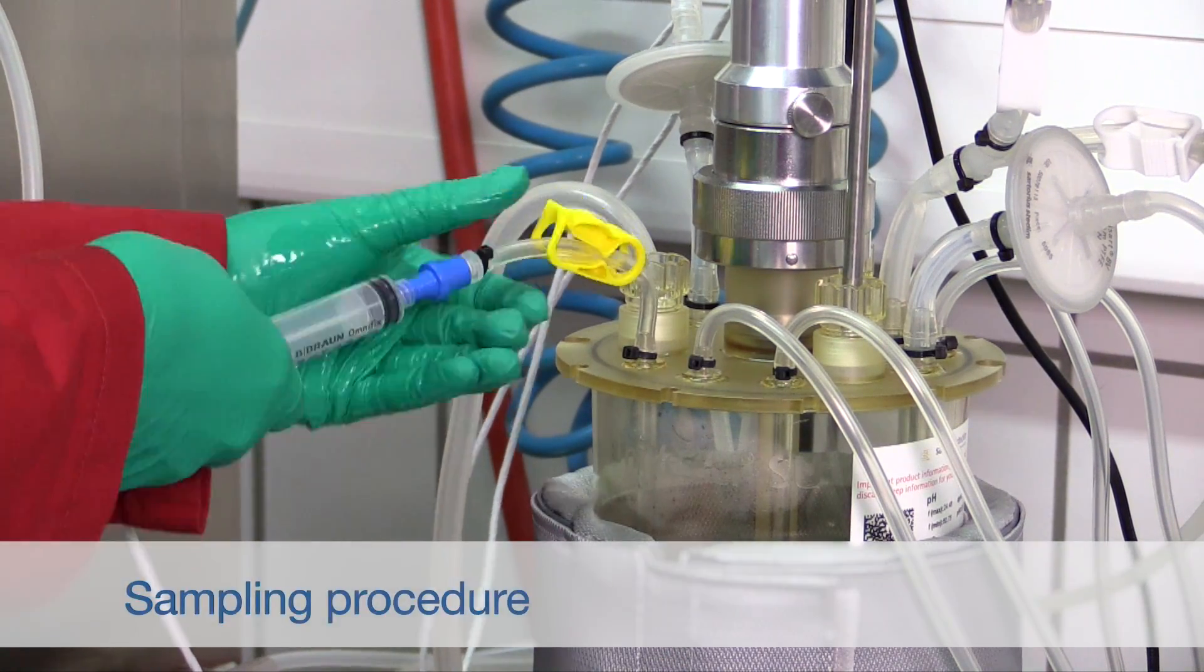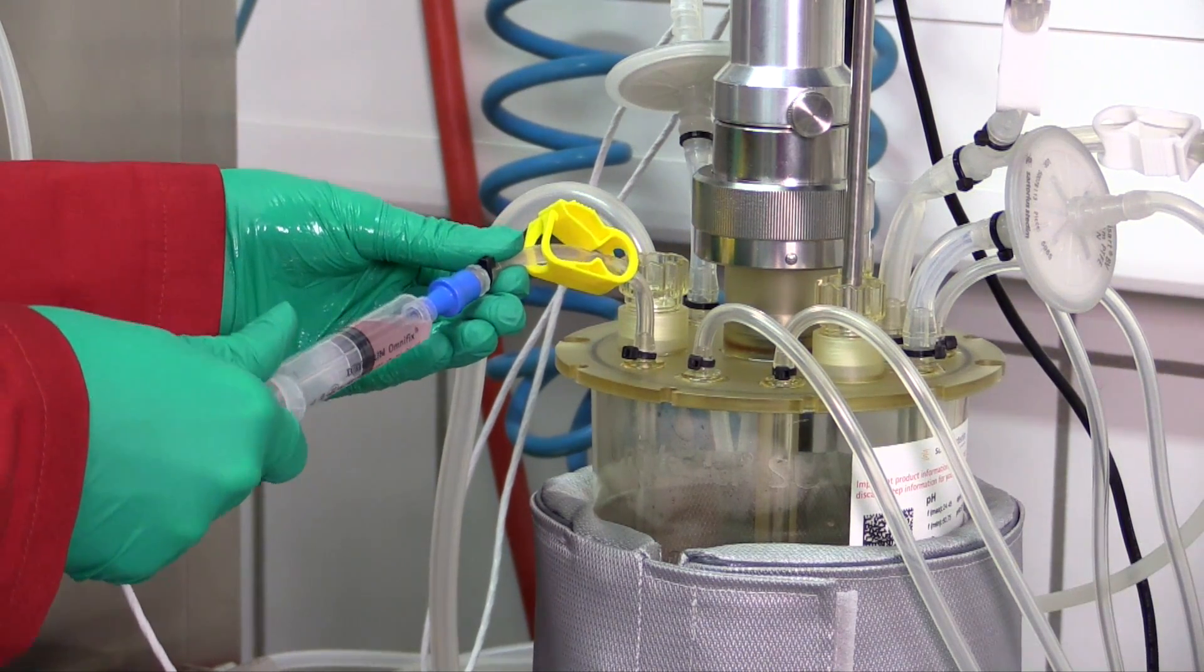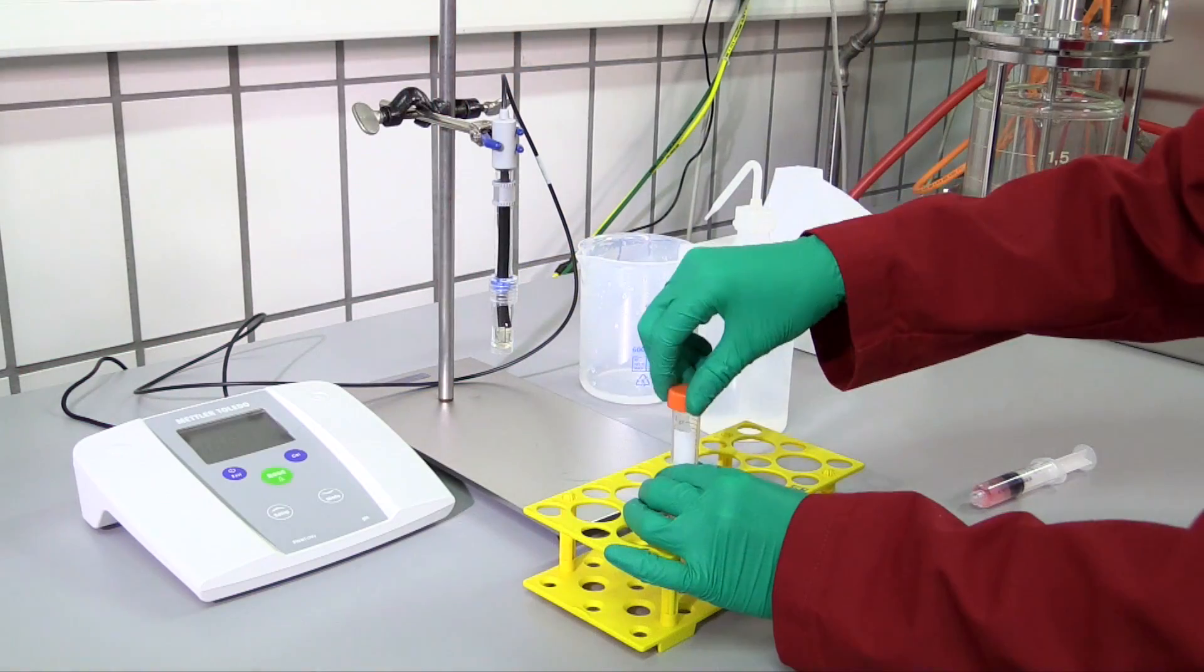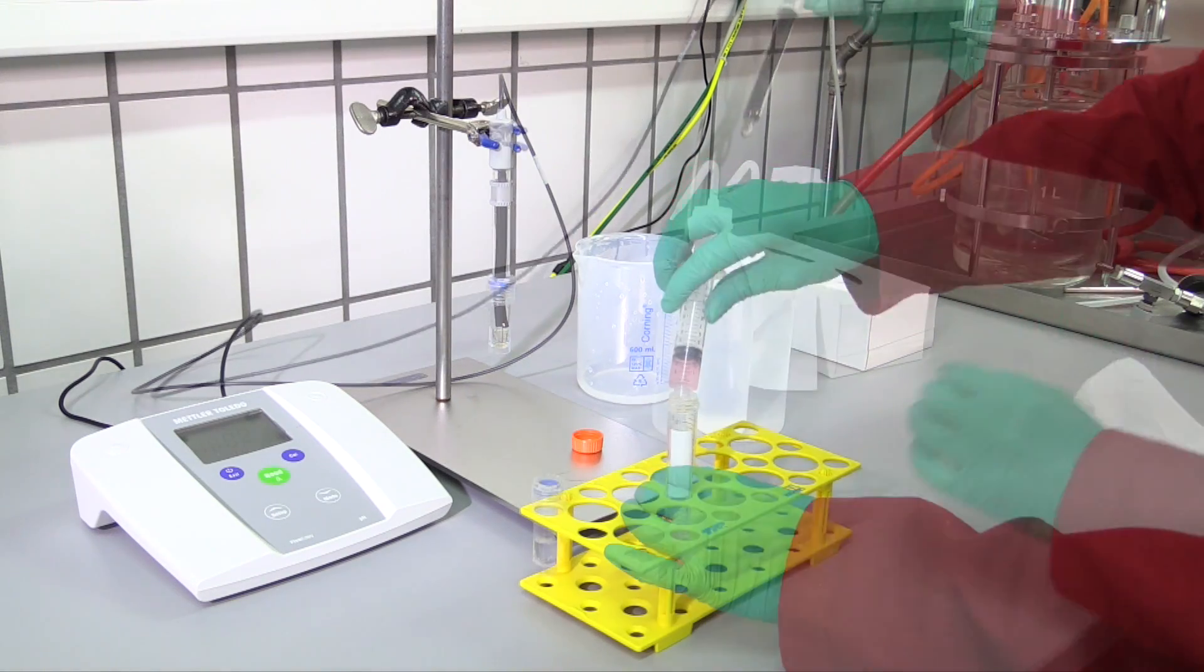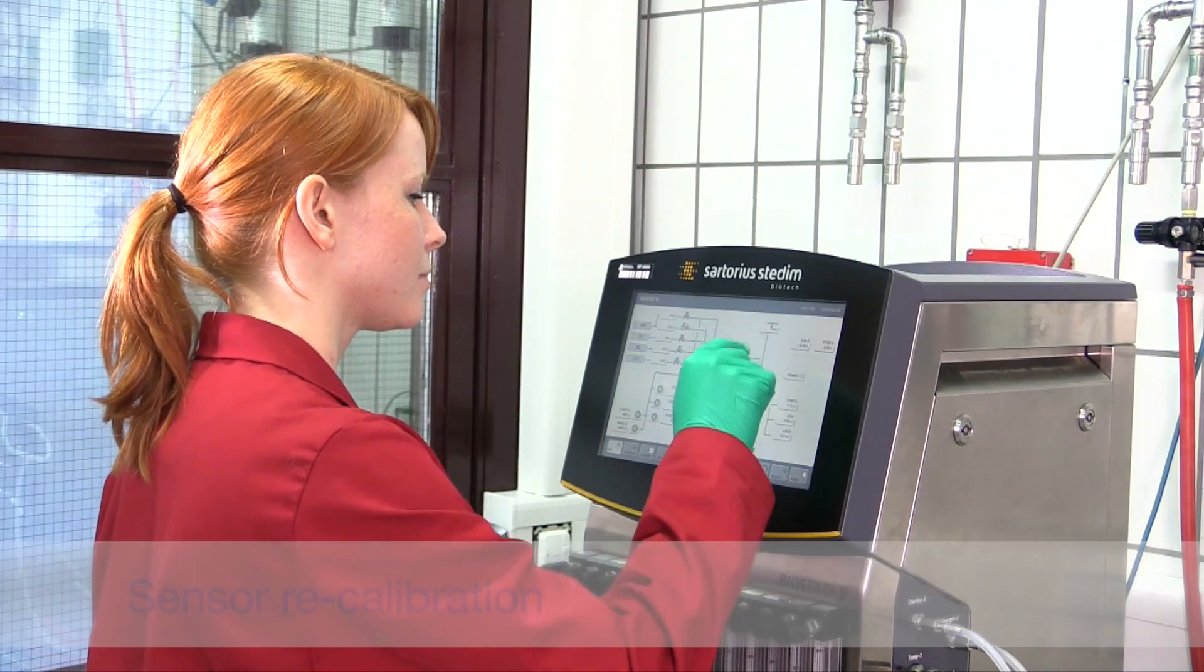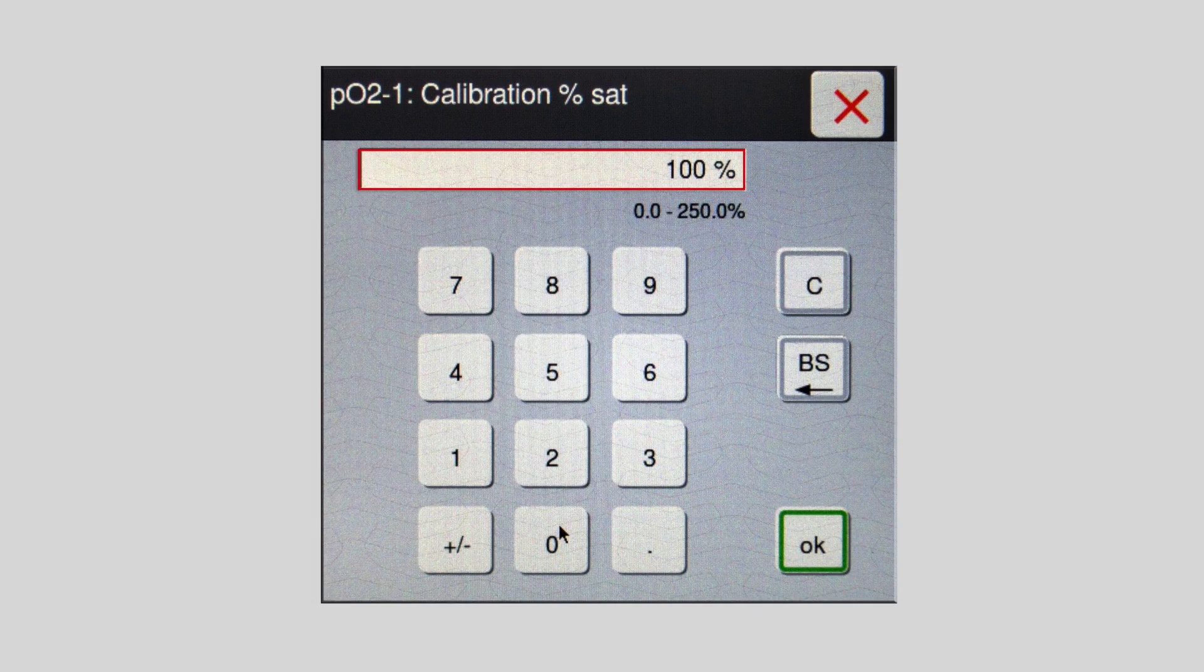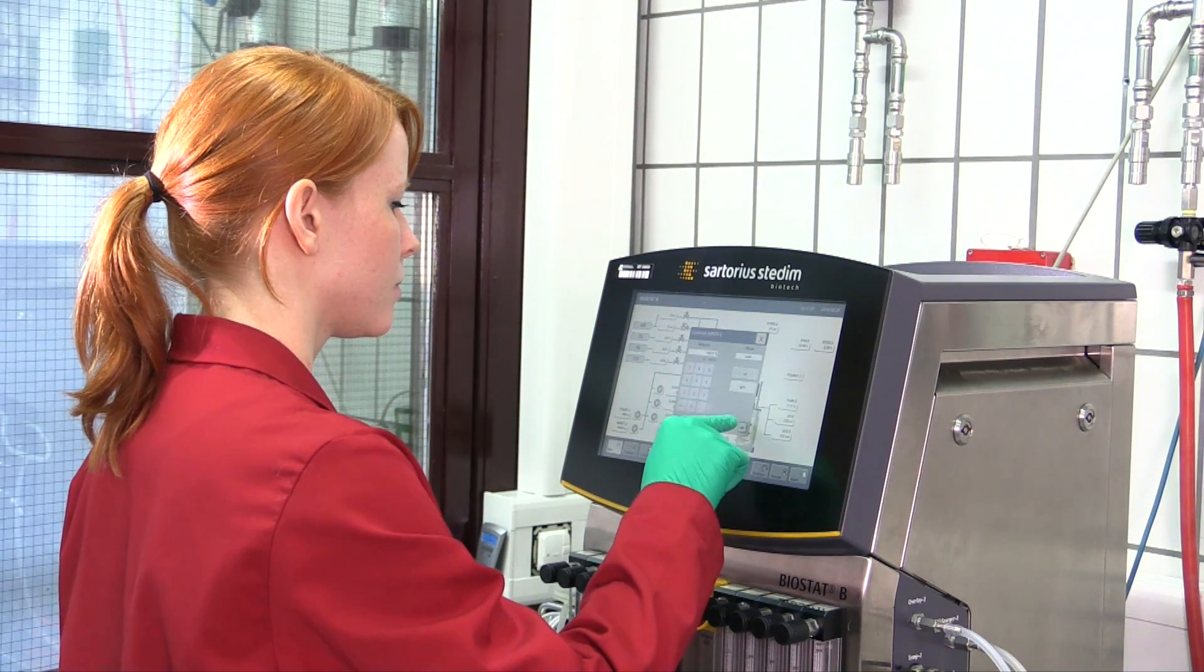This is followed by recalibration to ensure that the values have been correctly measured. To calibrate the pH, a sample of the medium is taken with a sterile syringe through the sample port. The pH is measured with an offline pH meter. The value obtained is then entered into the control unit. For dissolved oxygen calibration, the value is set to 100% saturation as soon as the medium is completely saturated. The pH regulation can then be switched to a set point of 7.2.